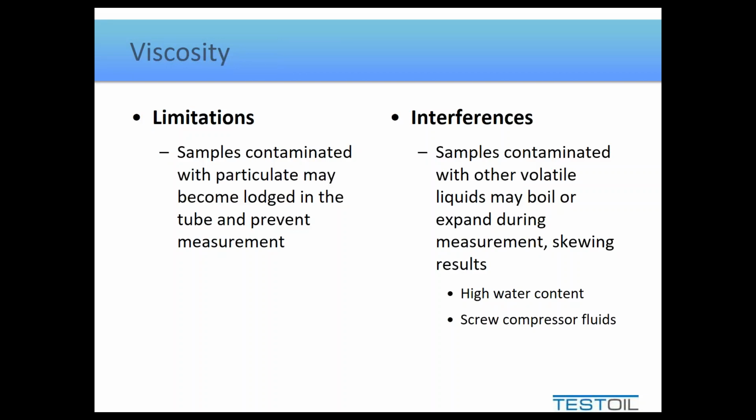This does not tend to affect the sample in any other way as long as it's done briefly, meaning less than 30 seconds worth of sonication. But if you do over-sonicate an oil sample, not only do you remove all the air bubbles, but you will start to break up the particulate. So if you're doing a test like particle count, you will start to skew the results from large particles into smaller particles, and it'll look like a totally different issue.